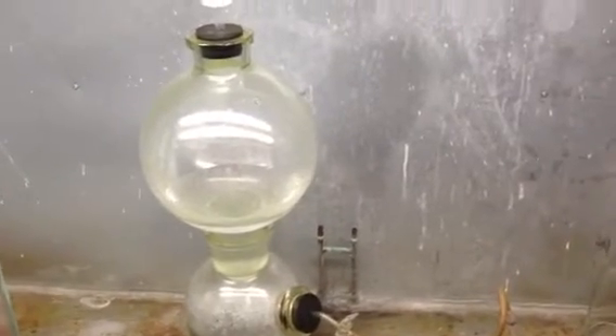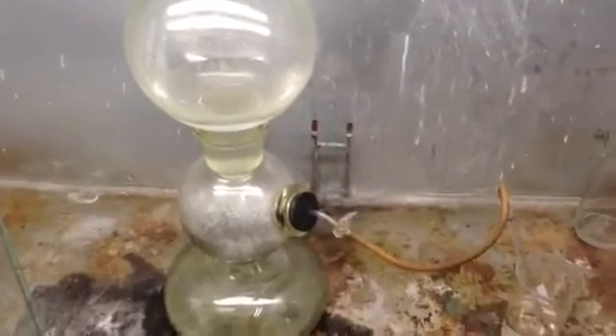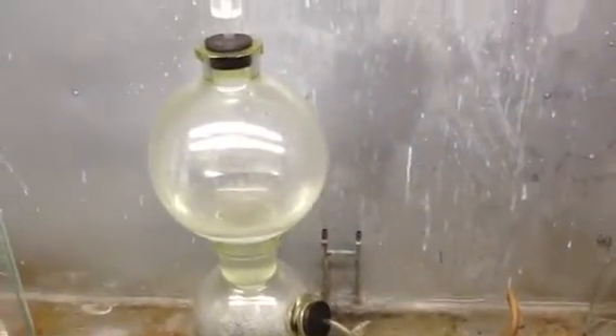Before gas was in compressed bottles, you would have to make it on demand, and you would do it with the Kipp's generator.